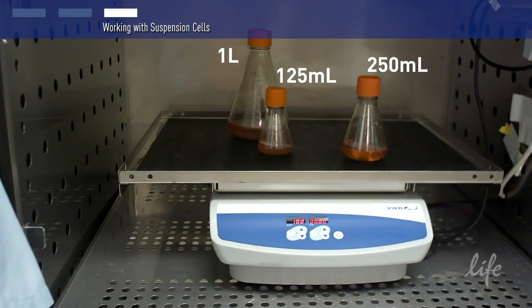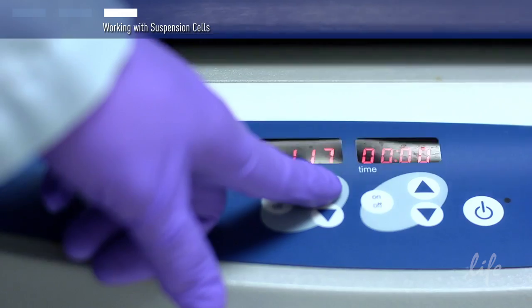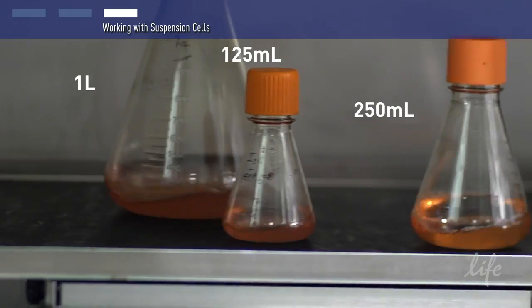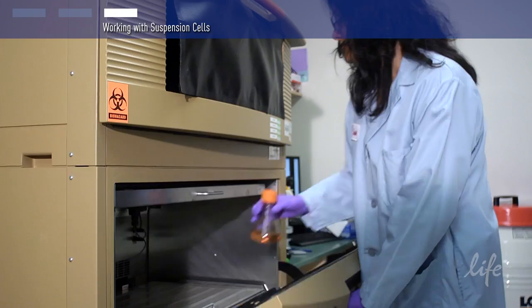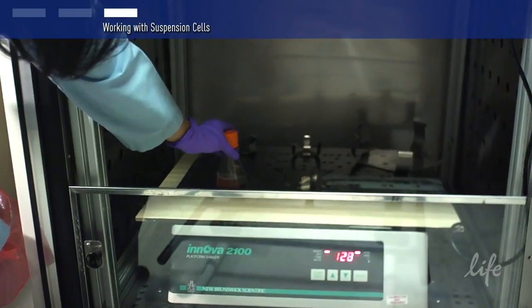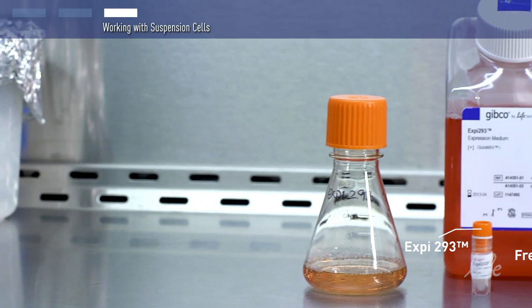A shaker setting of about 125 RPM will work well for most standard flask sizes. You should optimize the exact shaker speed based on your own culture system and shaker setup. Here's another tip: try lining your shaker platform with some sticky tape instead of the traditional flask clamps. This will make it easier to remove flasks and also to change the size and configuration of the flasks.